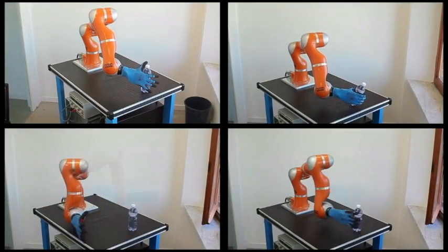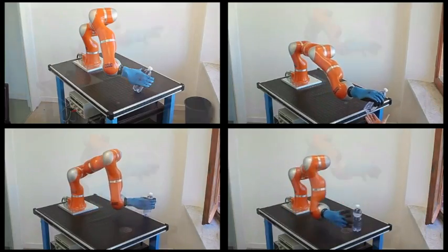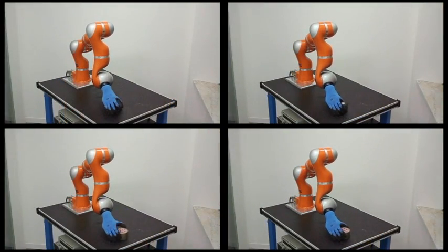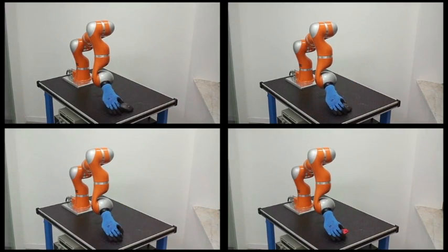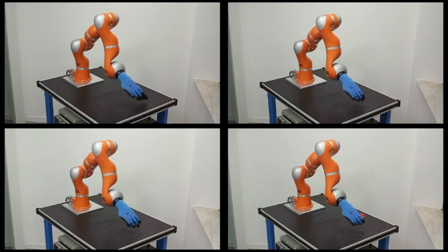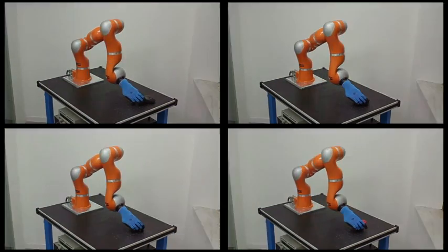To test the usage of the PISA IIT soft hand in a robotic scenario, the hand was mounted onto the end-effector flange of a KUKA lightweight robot arm. Notice that the robot was manually programmed to reach an area where the object was approximately known to lie and no grasp planning phase was executed.